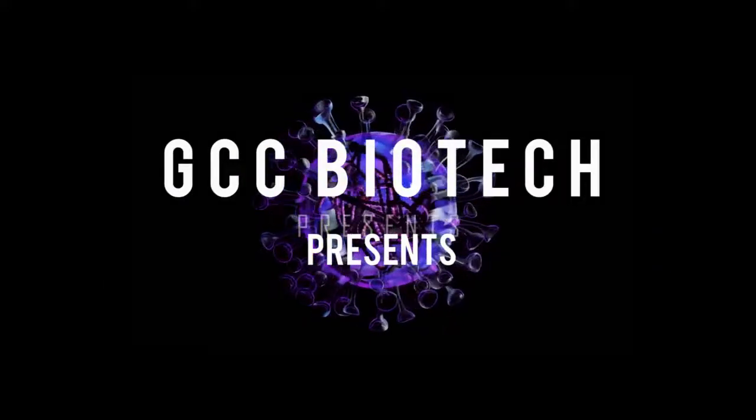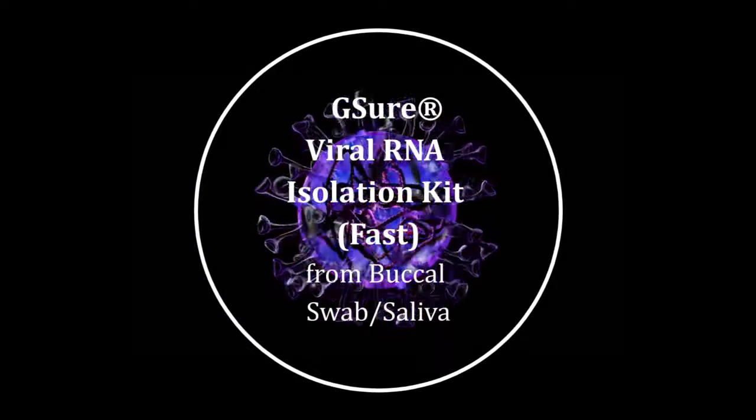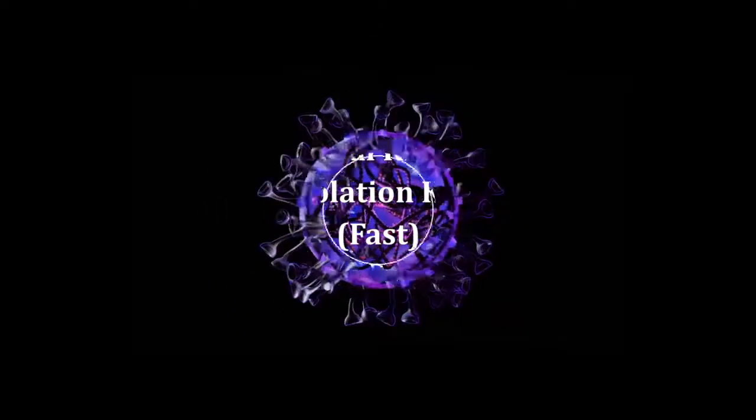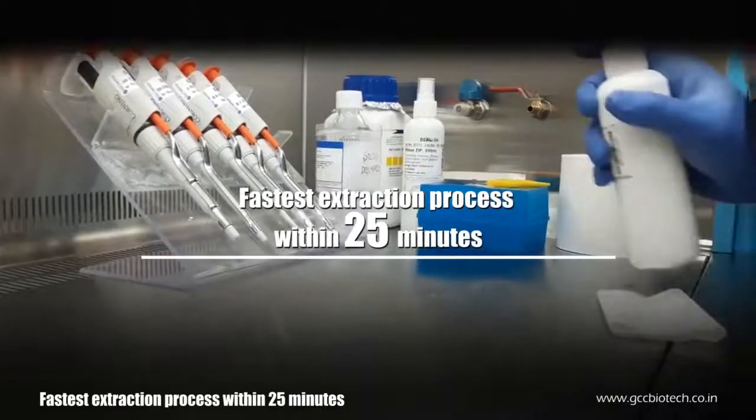GCC Biotech presents the G-Sure Viral RNA Isolation Kit Fast from Buccal Swab and Saliva Samples. The process takes approximately 25 minutes.